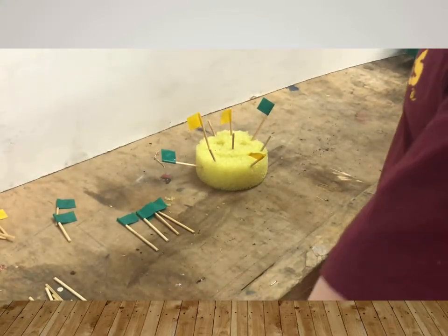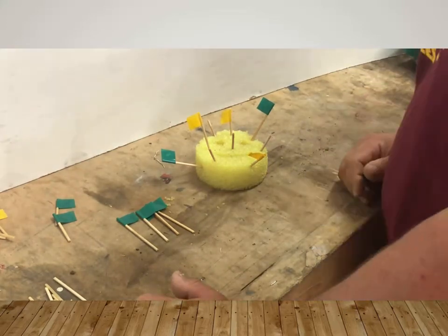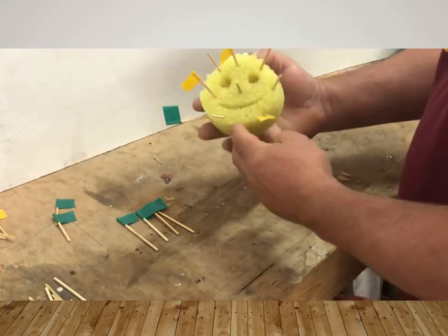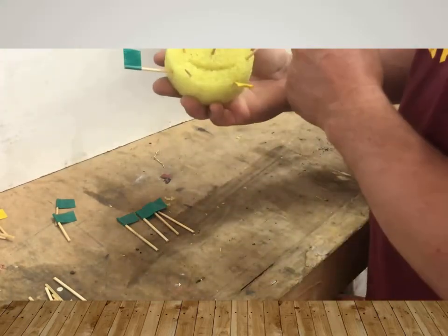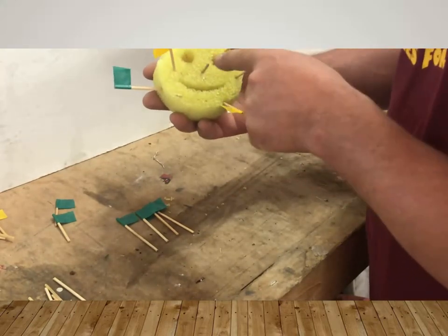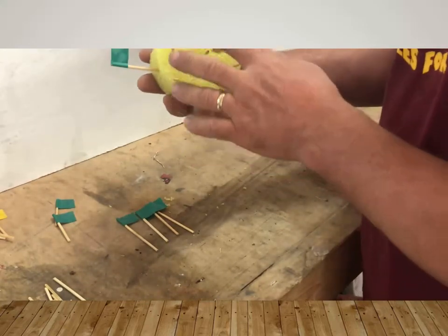Okay, in this other lab scenario, we're supposed to demonstrate what happens when you treat a soil with lime, in this case calcitic lime, so calcium carbonate. In my sample soil here, I've got a calcium, potassium, potassium, potassium, and I have 1, 2, 3, 4 sites that are just negative charges with hydrogens attracted. We can't see them, I don't have a color.